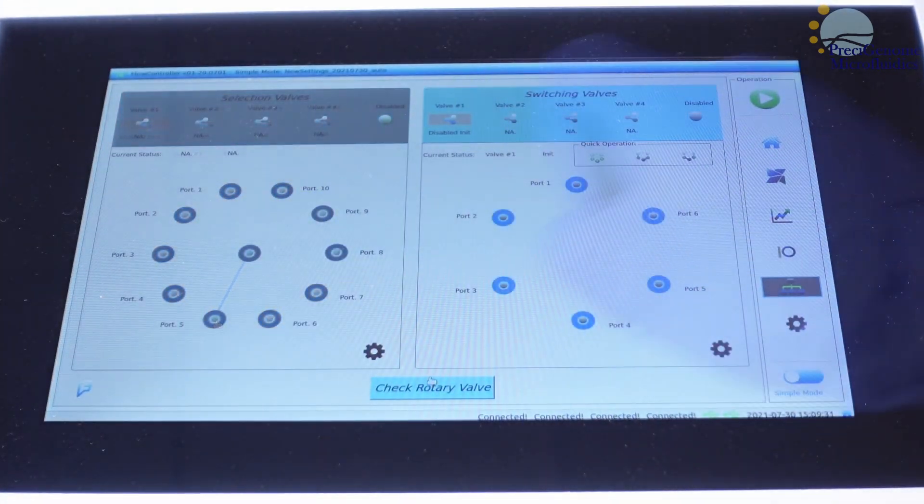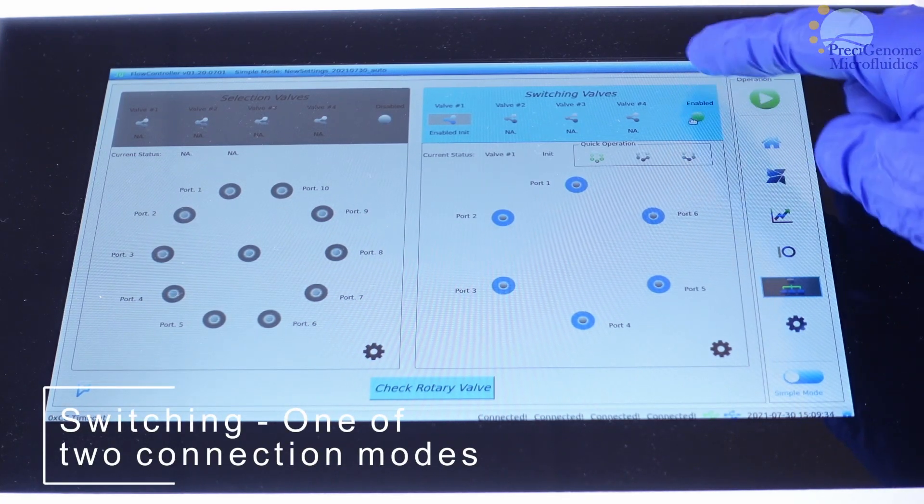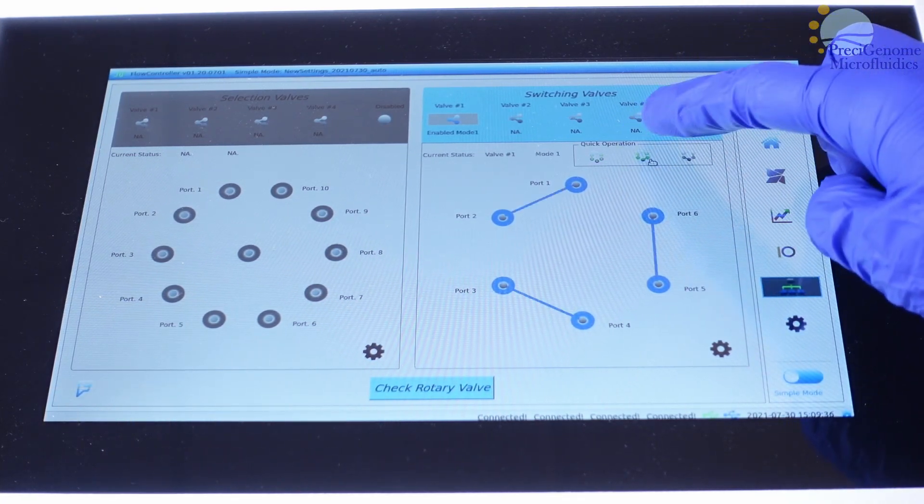For switching valve, we instead can choose between two modes connecting neighboring ports.